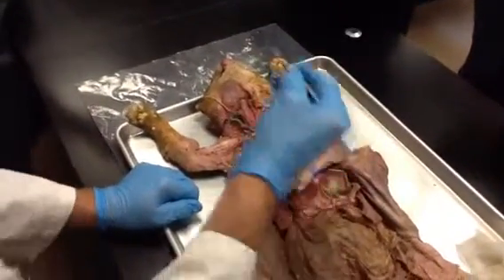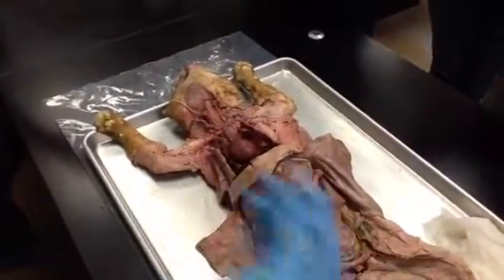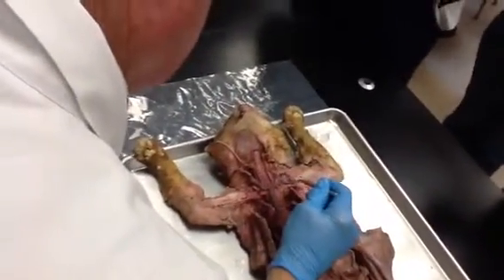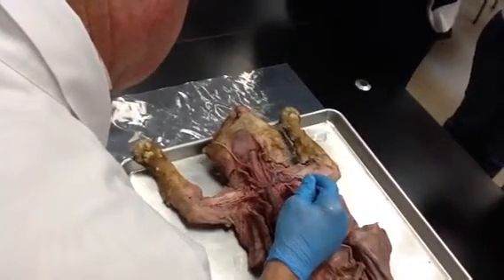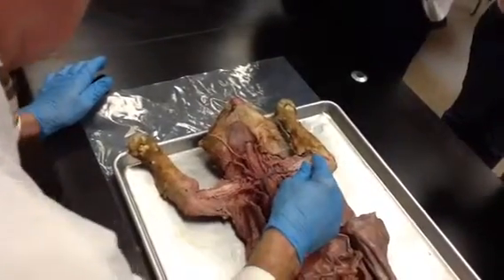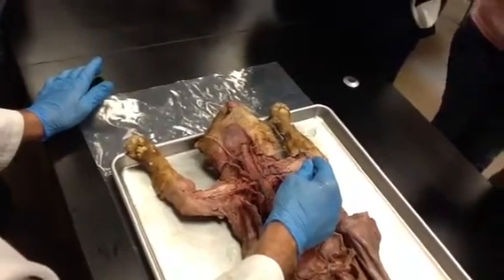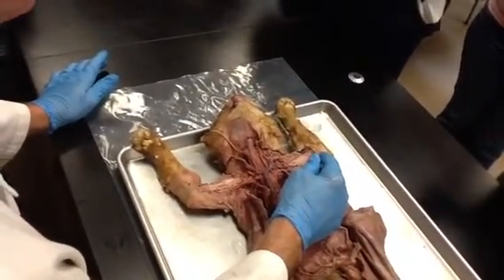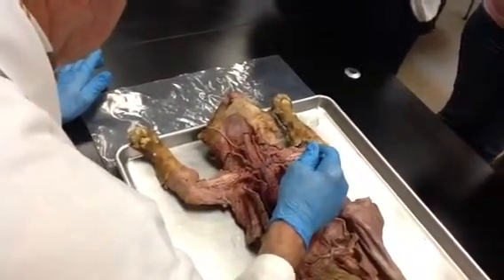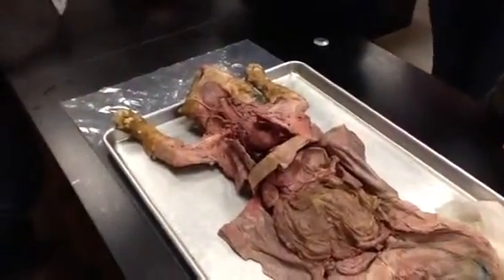Likewise, we talked about the difference between arterial flow as opposed to venous flow. So here, this is my cephalic, this is my basilic, and this one here in the middle between the 2 is my brachial. And they continue on toward the, well, this would be the elbow really. So this would be your median cubital vein within that antecubital region. That's pretty distinct right here. You can see that there's a lot of similarities in venous flow in humans as compared to venous flow in the cat.